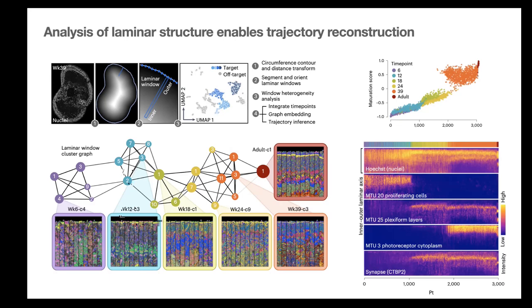And then you can show it by making collages of these MTU images for different time points, where you can see it's nicely ordered and the structures make sense, or having the complete overview by creating heat maps over this trajectory and looking at either MTUs or just nuclei stains, for example the Hoechst stain for the nuclei.